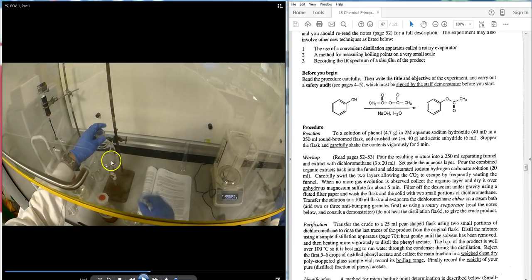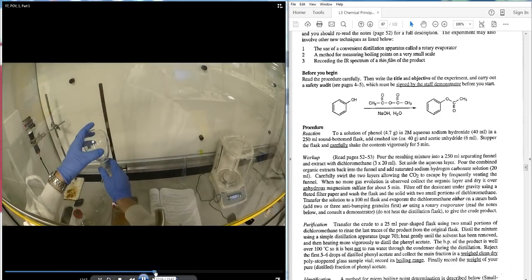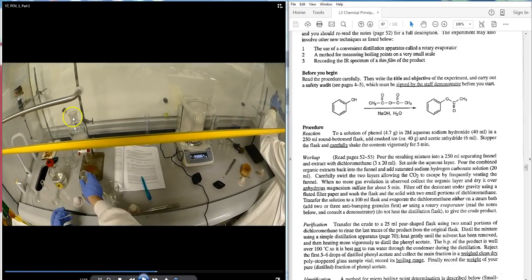The separatory funnel is clamped onto the stand. Make sure the key rotates and will not leak. Pour the reaction mixture in using a wide-neck funnel, then wash with three lots of 20 mL DCM. Use some of that DCM to rinse around the funnel and rinse the contents of the flask out with a pipette to ensure full transfer.